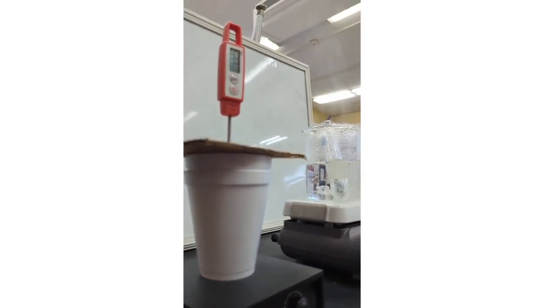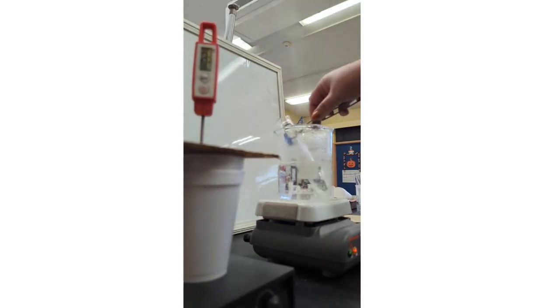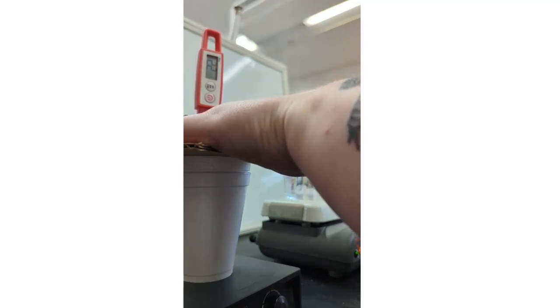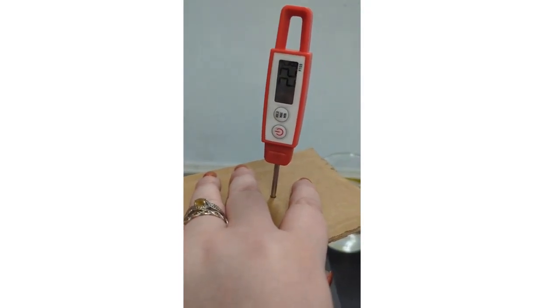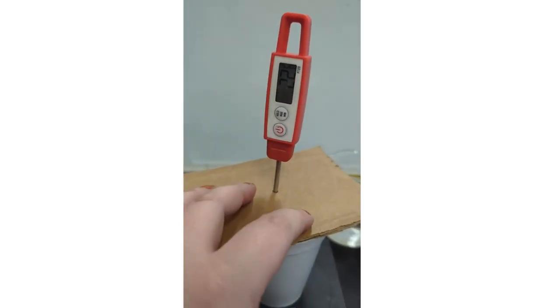Okay. So I'm going to take this and set my camera right here. Grab my metal and then very quickly open this up. Invert so my hot metal goes in, stick my lid right on top, hold it down. And now this is spinning, so the water and the metal are transferring heat. And it looks like my temperature is staying constant at 22.8 degrees Celsius. So I'm going to call that my final temperature of the system.